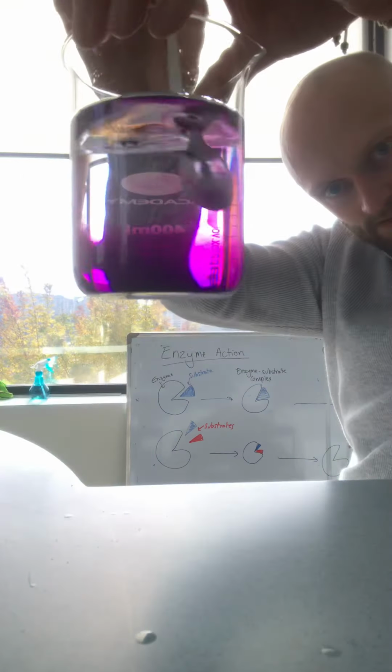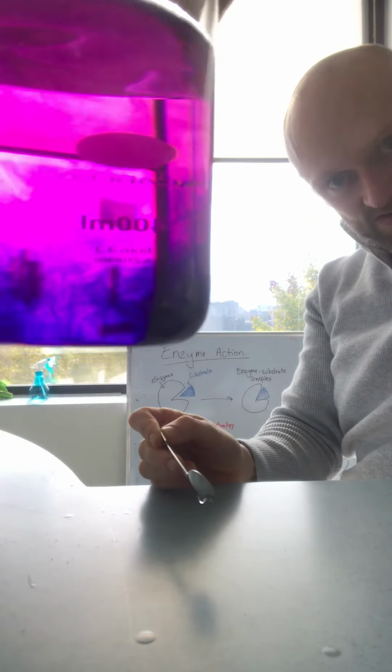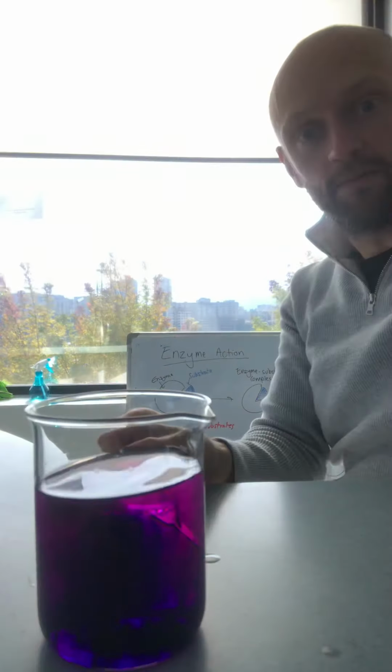Whee. Cool to me anyway. I'm done with the science, I'm just videoing what this stuff looks like now.